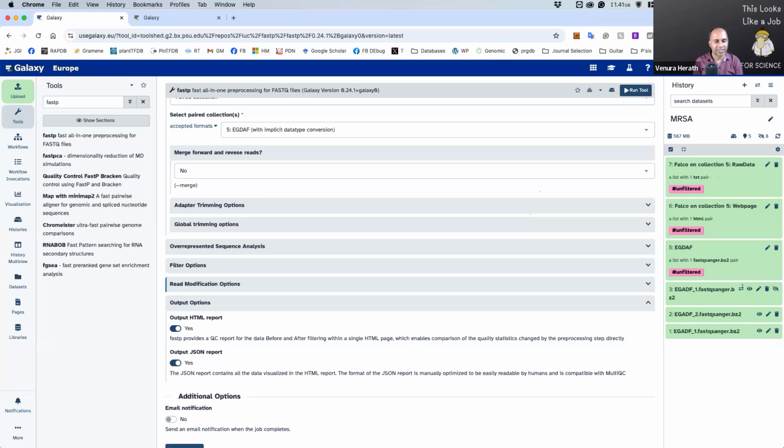So see whether you can run all the options without logging in or signing out. Okay, keep me updated about your issue. Let's see what we can do.